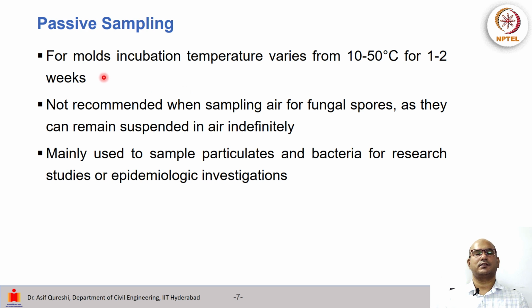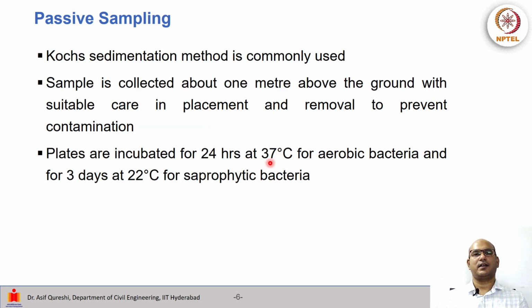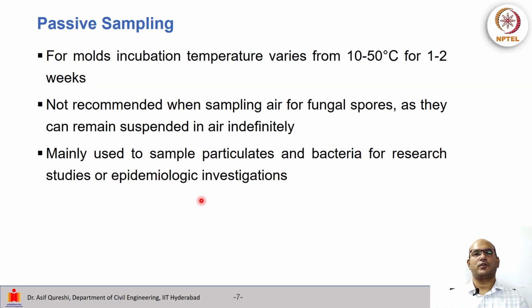For molds, the incubation temperature is 10 to 50 Celsius and for 1 to 2 weeks. So more time is given for molds to grow compared to, for example, bacteria.